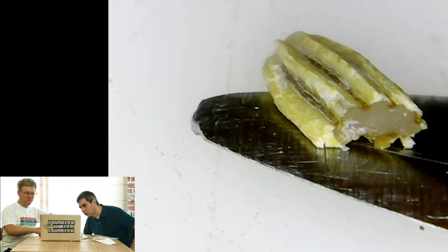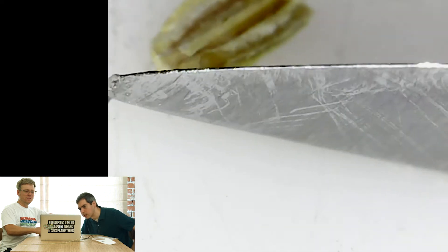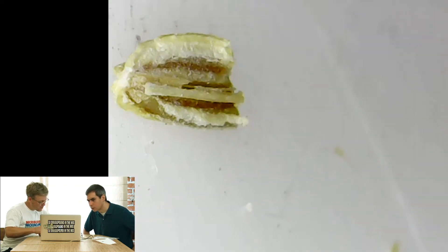I'll try to put it on the tip of the knife here and see what's inside. It flew over here — there's more over here too. It chopped, it split in half, and in half the other way too. Oh, that's cool. Look at that. What is that? It almost looks like a pecan or something. It's nougat. That is interesting. That's inside of a fennel seed, I guess.